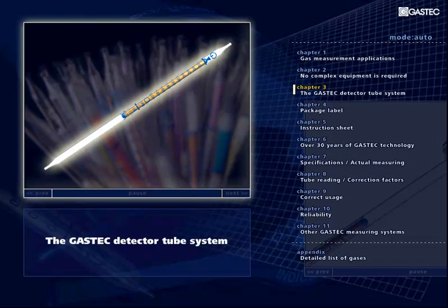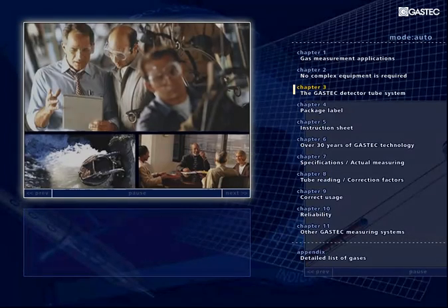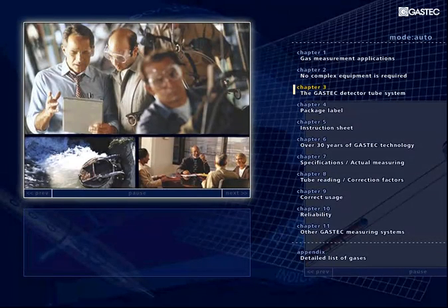So, before going into the technical details, let us briefly consider the overall significance of detector tubes as well as their use. Along with technological advances in the chemical industry, such byproducts as gases and vapors of varying degrees of toxicity, as well as in varying concentrations, are increasingly critical issues in our world. Moreover, in our living environment, air pollution and groundwater contamination are attracting increasing concern.